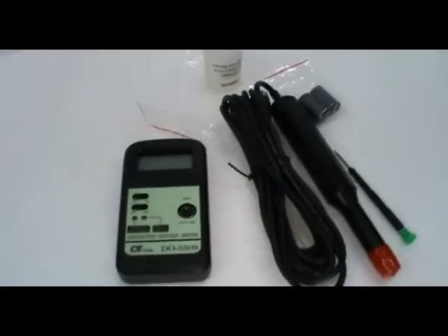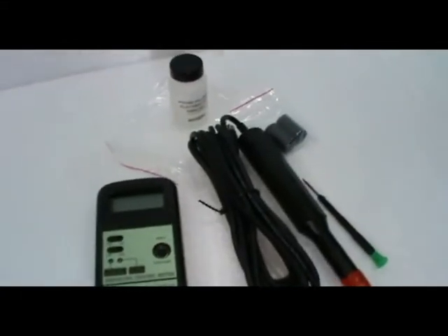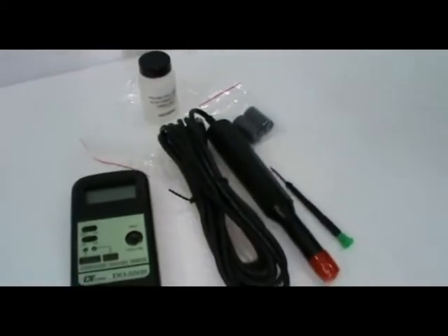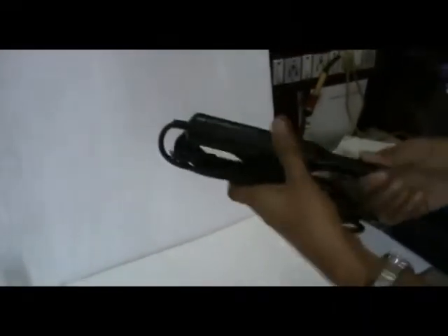Probe activation: Remove the red color cap from the probe.